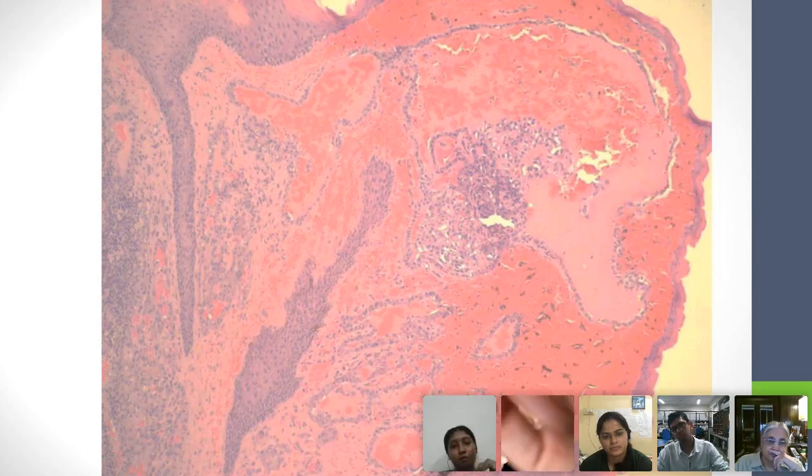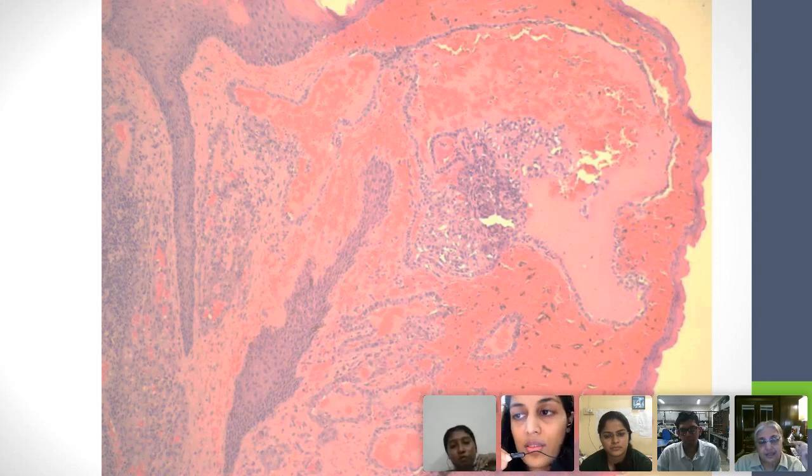Ma'am, there are these multiple cysts, the ones with the single lining. Then why don't we leave it as cysts? These are cysts lined by a single layer. Can you see that? Yes, ma'am. A single layer, yeah. So why don't we say that these are cysts? Okay, there's hemorrhage within the cyst. You can see this, and there is some proliferation of the lining epithelium of the cyst. At least in the larger cyst, you can see that, but the others are all single-lined epithelial cysts. What's the big issue? And do you think that this cystic structure and its epithelium is actually arising in the overlying epithelium?